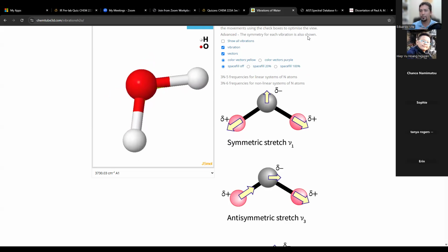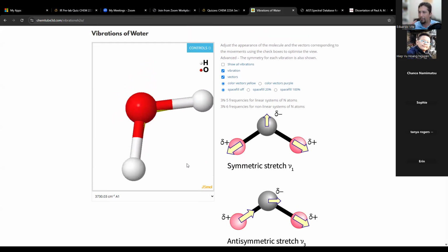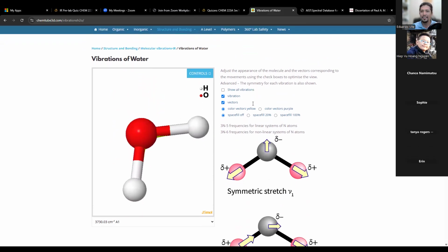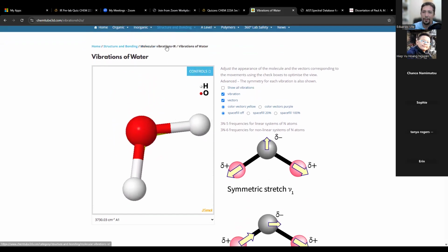I mean, we're trying to make it simple by saying arrows and stuff, but this is really like two vector matrices canceling each other out. Like you take the vector sum of two dipole moments and they give you the zero vector. That's like linear algebra stuff. We're trying to simplify it by simply showing you the motions and the arrows and the directions. So does this make sense? Are we good? Any more questions about this one? I'm going to show you a more complicated molecule now.